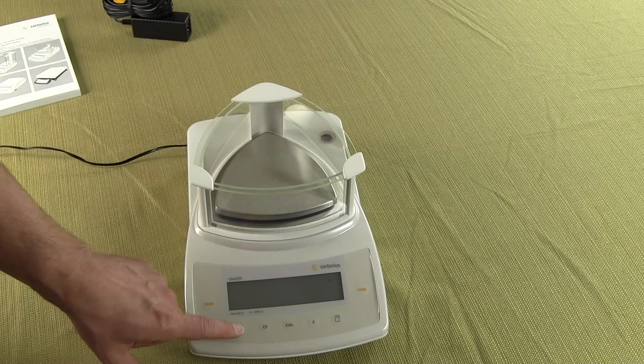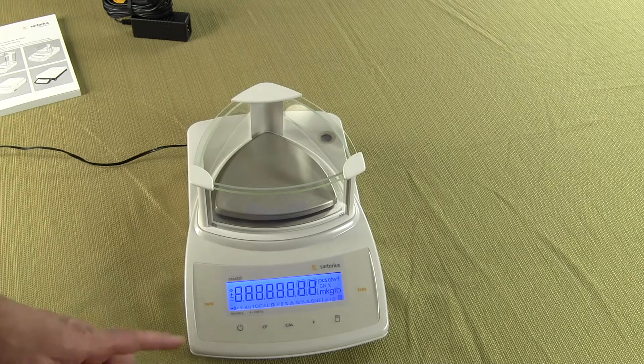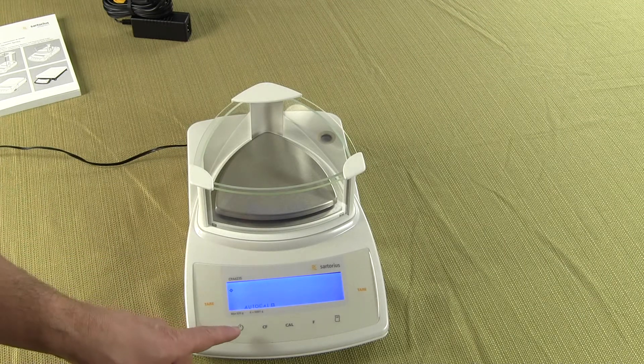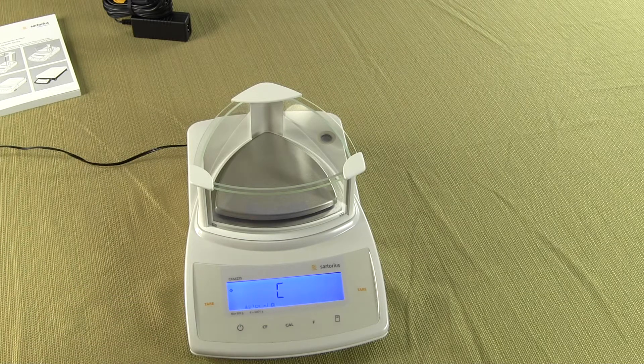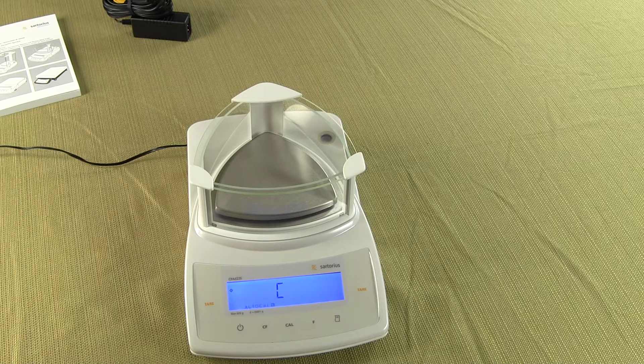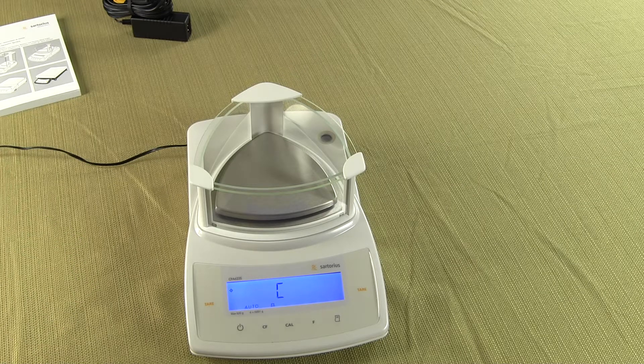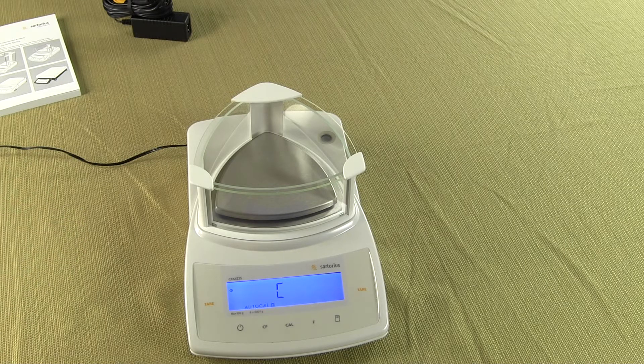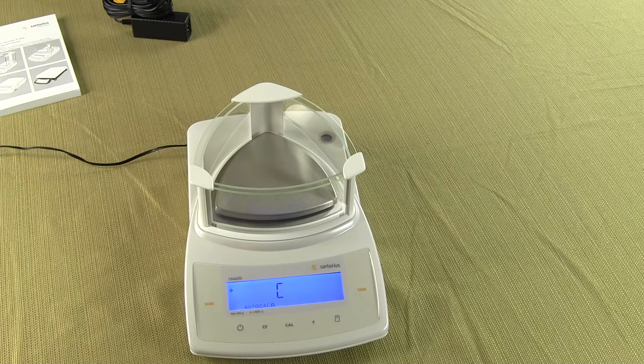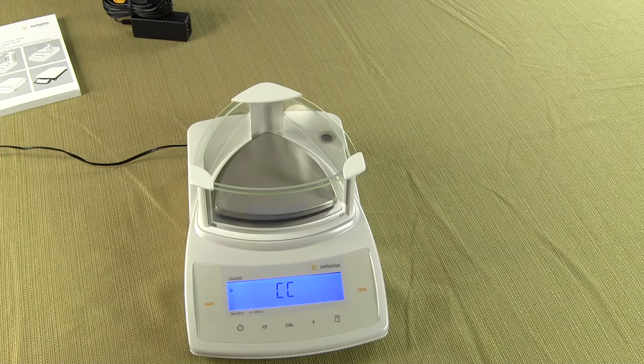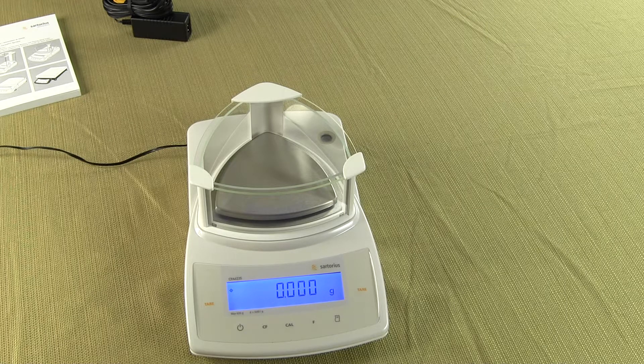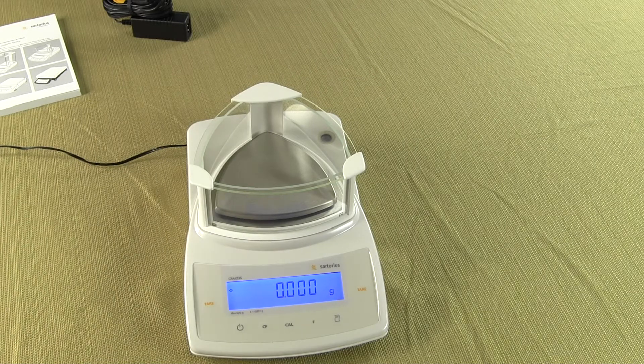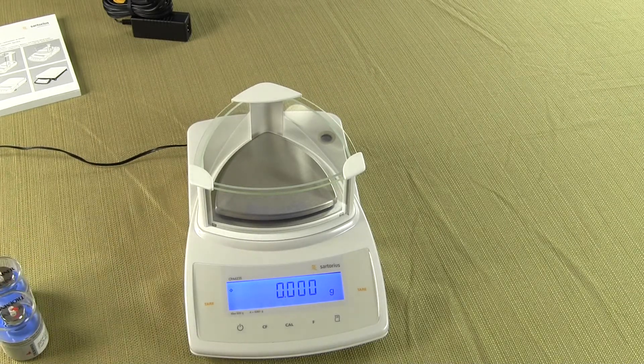We're ready to power up the Sartorius CPA 623S. And you notice when the balance powers up it does a functional test and you can see it says Auto Cal. It automatically goes out and performs a calibration. So when the balance is first powered up it senses any temperature change or the last time the balance was calibrated. Now prior to this demonstration I did have this balance running for a good hour. So it has acclimated to the environment that it's in. So the balance now reads zero zero and we can use some external calibration weights and see how this balance performs.